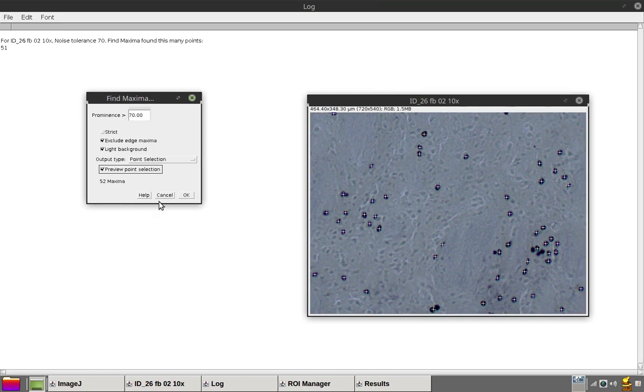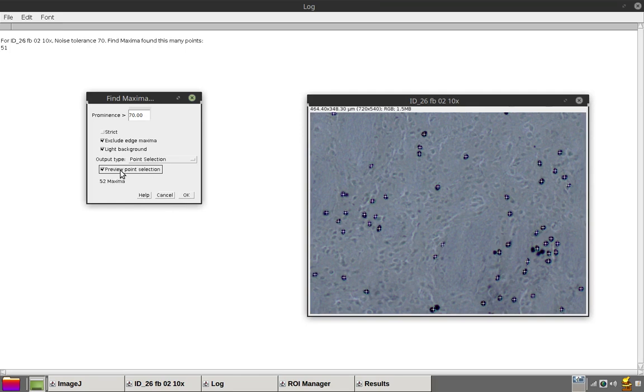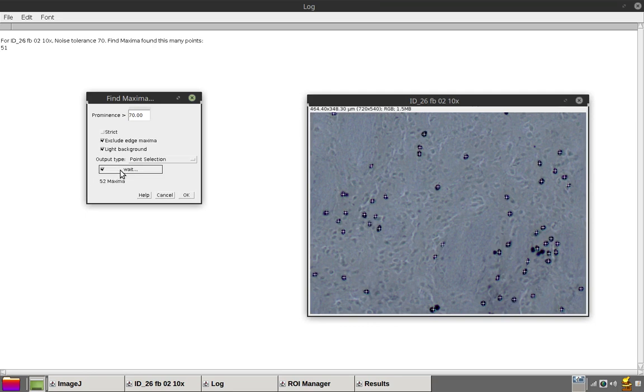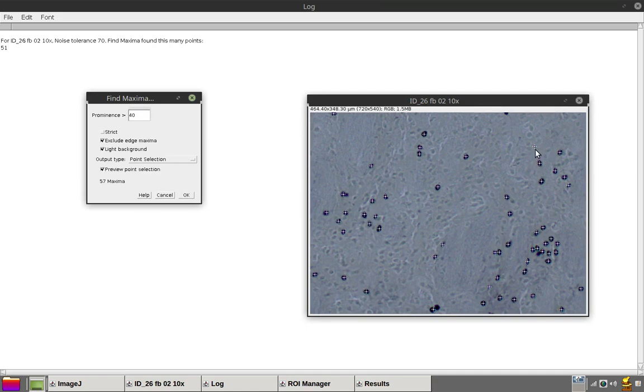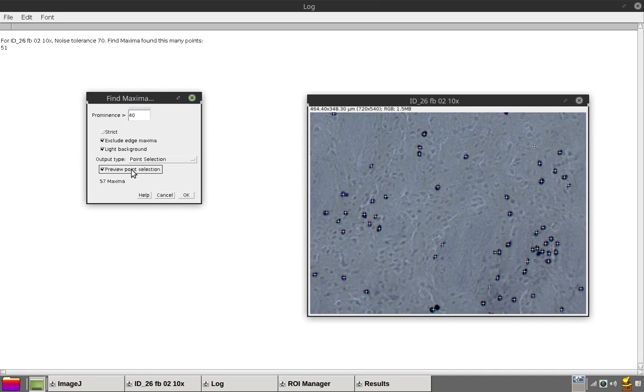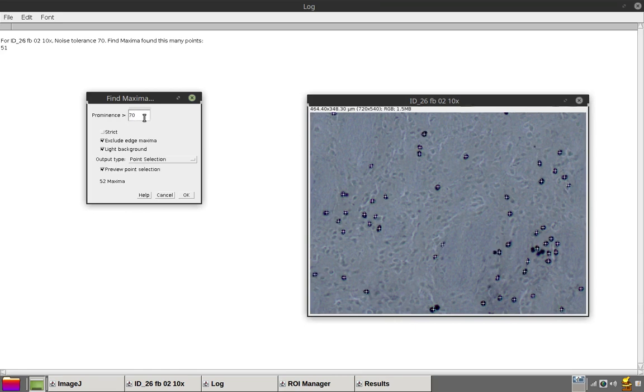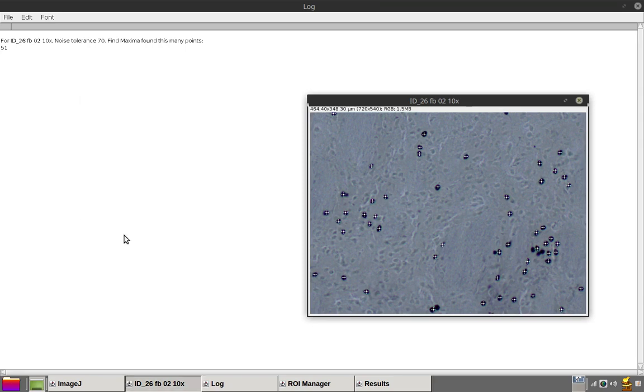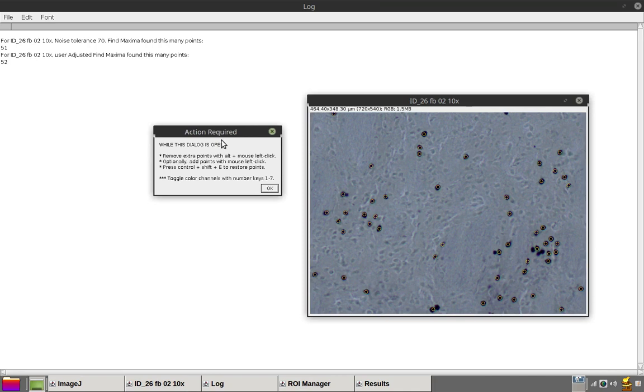I think seventy works fine. Note that if we were to set this to 40, this inconsequential point would have been selected, which is why it tends to be a good idea to set a higher prominence. Let's stick with seventy.